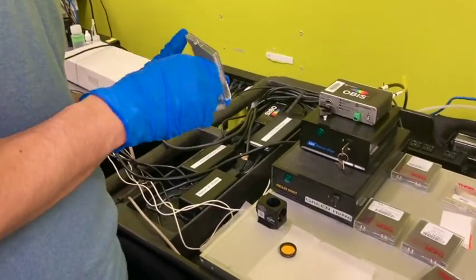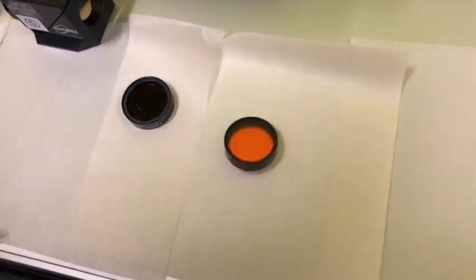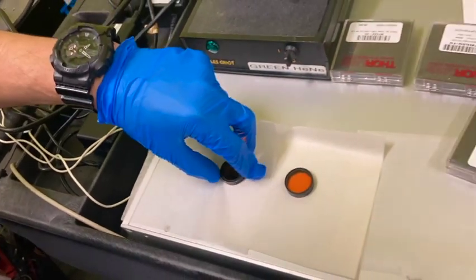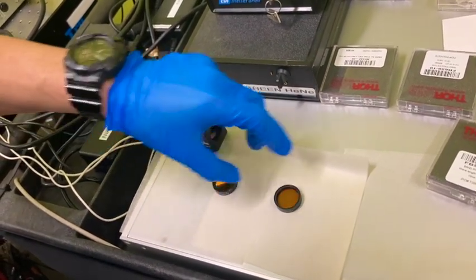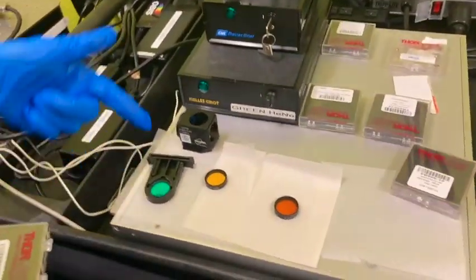And we have two here, and we can see the difference in colors. These two are at around 600. So this is 5, 6, and this is around 600. And we have another one here. So apparently they look different.